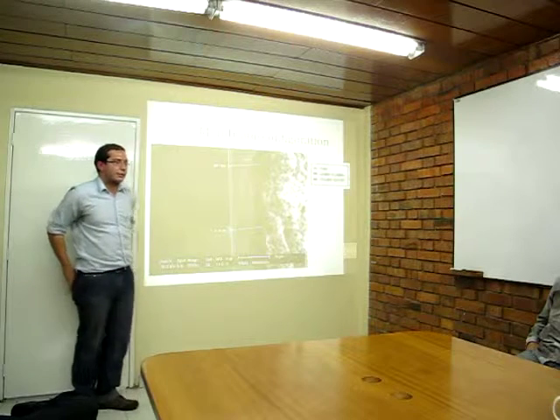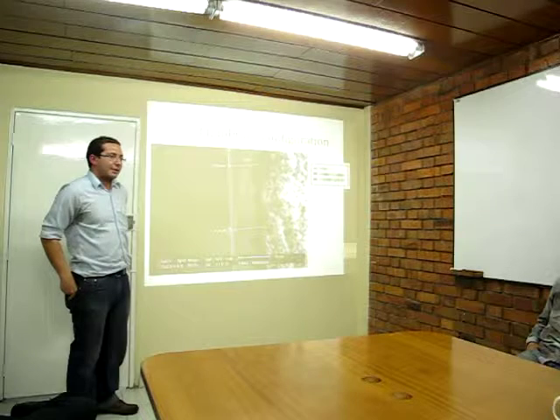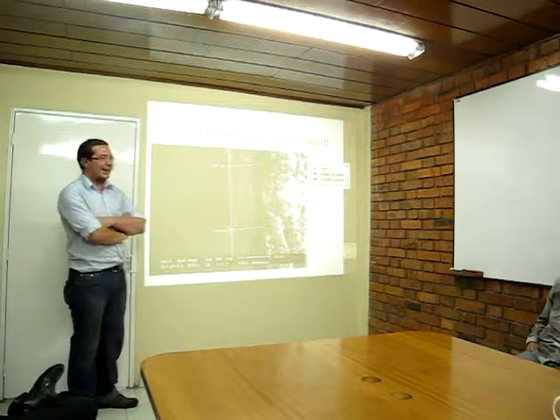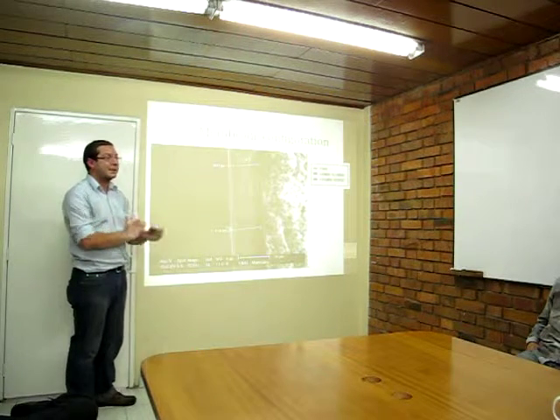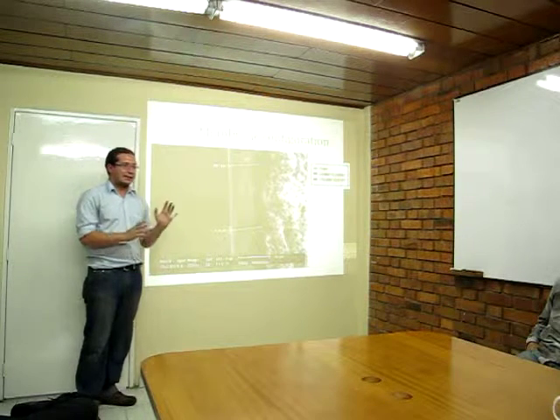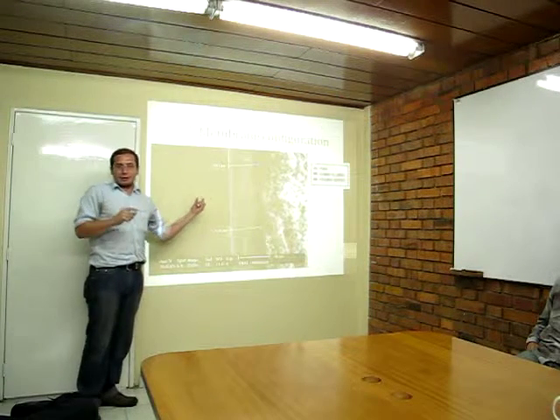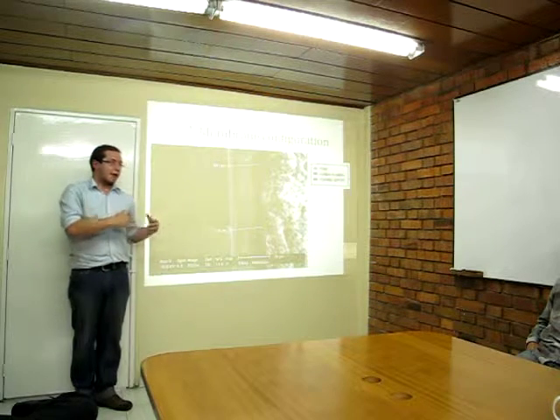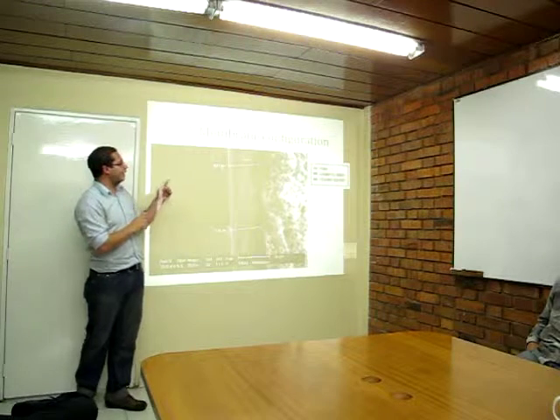But can you measure the thickness of the membrane? It is too small. I tried every form, but I cannot see the thickness. We took all the equipment in Manizales, and we made the dip coating of PDMS with a big thickness, and we can see this thickness with SEM.